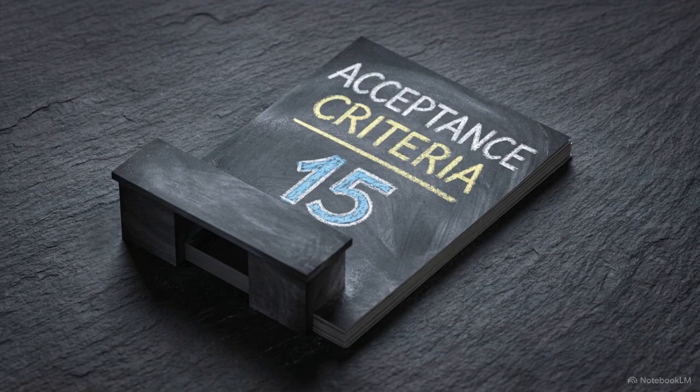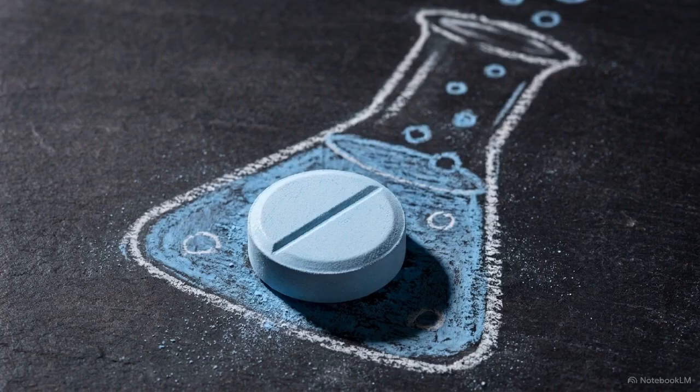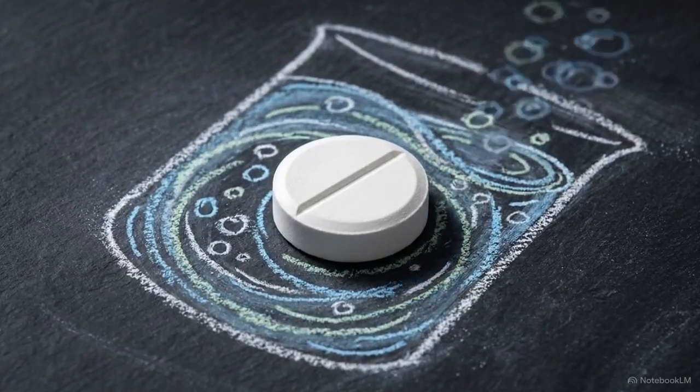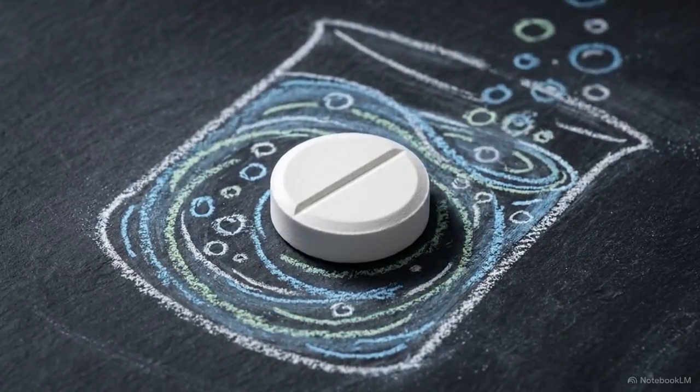The regulatory acceptance criteria for F1 is a score of 15 or lower. Because 22 is greater than 15, the generic has failed the first test of similarity, proving that the physical gap in that critical early release window is simply too wide for quality control to ignore.